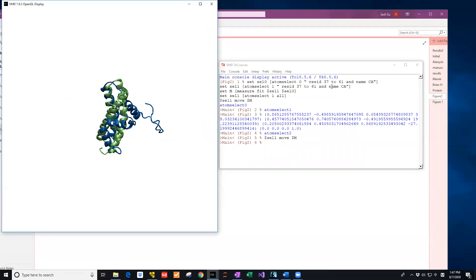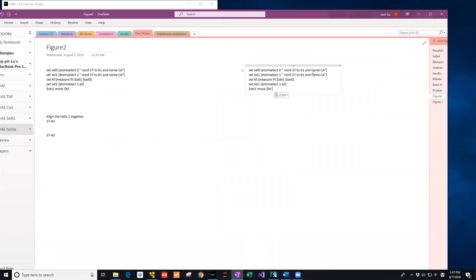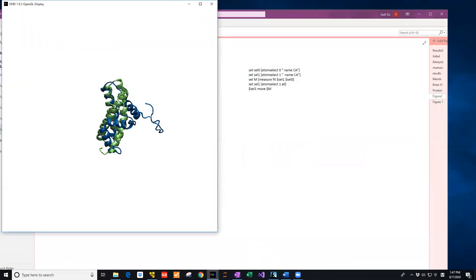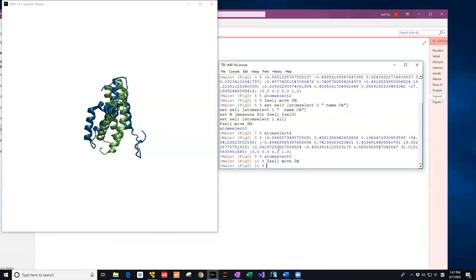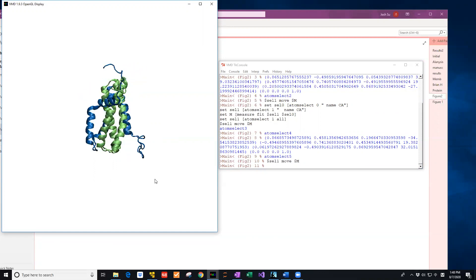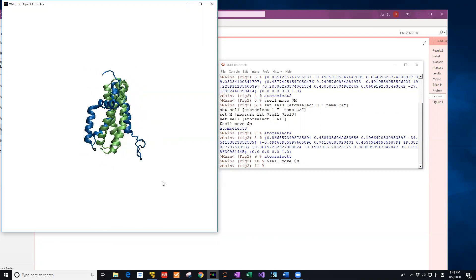If you want to align the whole protein together, you just select all atoms — for example, just use 'name CA' to select all the C-alpha atoms of the protein. Paste the code. Right now I aligned the two proteins together using all the C-alpha atoms. You can see the result is not very good, so let's go back to using the previous approach.